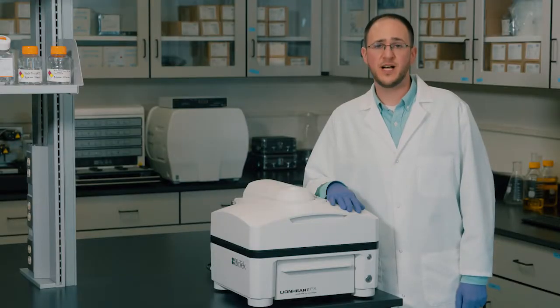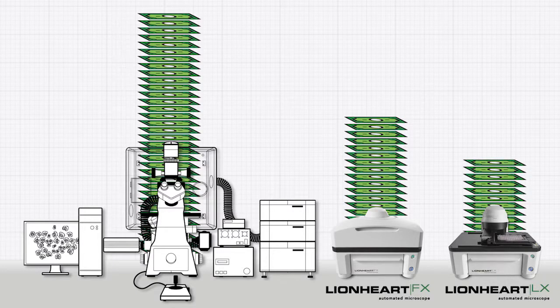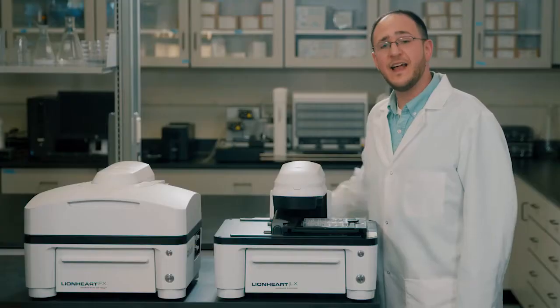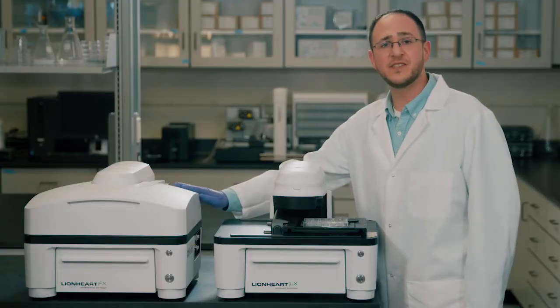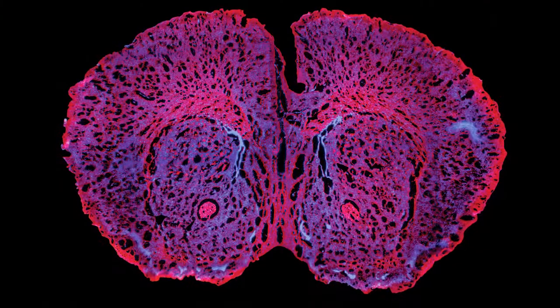With its integrated compact design, Lionheart is surprisingly affordable, a fraction of the cost of a manual system equipped with multiple add-on modules for automation and live cell imaging. Lionheart FX is ideal for live cell imaging workflows, while Lionheart LX meets the needs of automated endpoint microscopy.